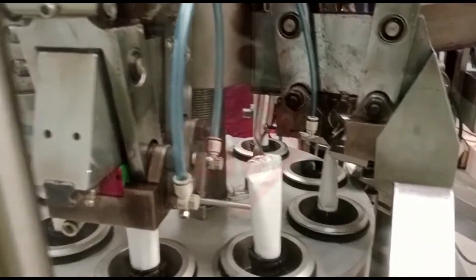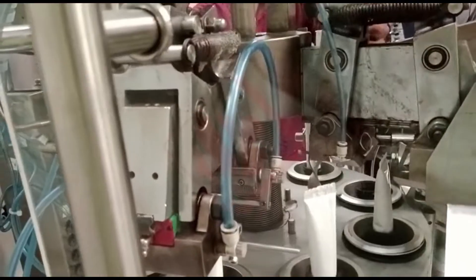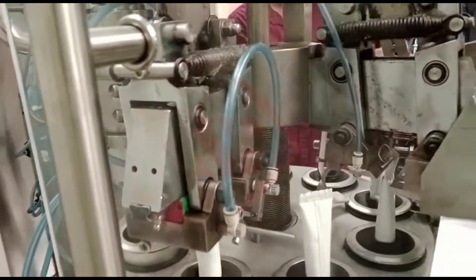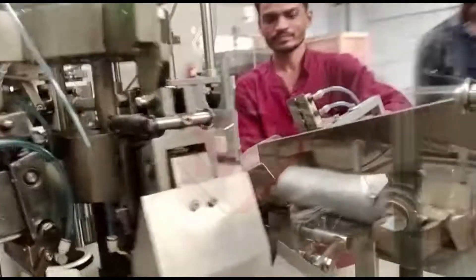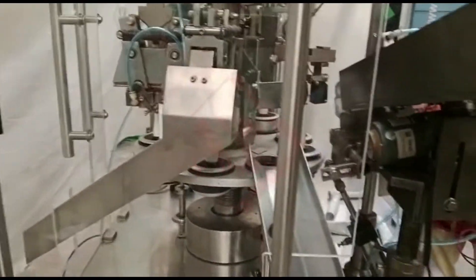Control Panel: The machine is typically operated through a control panel, which allows the user to set parameters such as filling volume, sealing time, and other variables. It also provides monitoring and adjustment functions to ensure efficient operation.